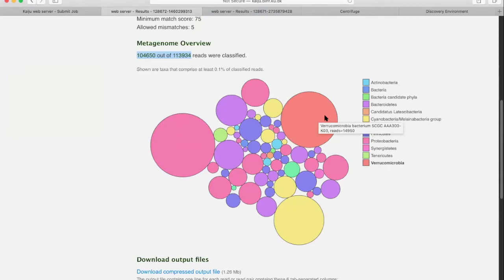This is a marine sample, so I would not expect this. Here we have some cyanobacteria that's expected. It says Nostocales if you look at the pop-up text. That's unlikely.